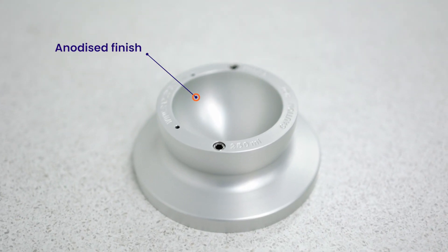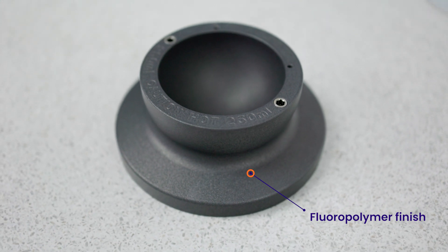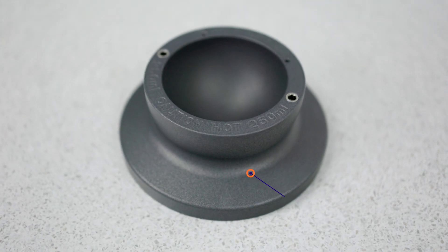You can see this one is anodised with the silver finish. We also do the blocks in a special fluoropolymer finish which is more chemically resistant and therefore just easier to keep clean.